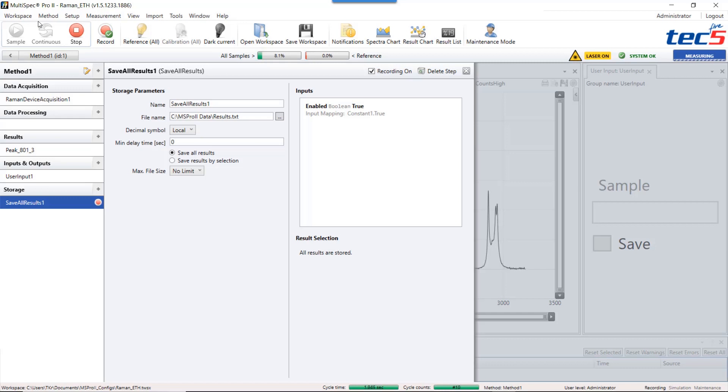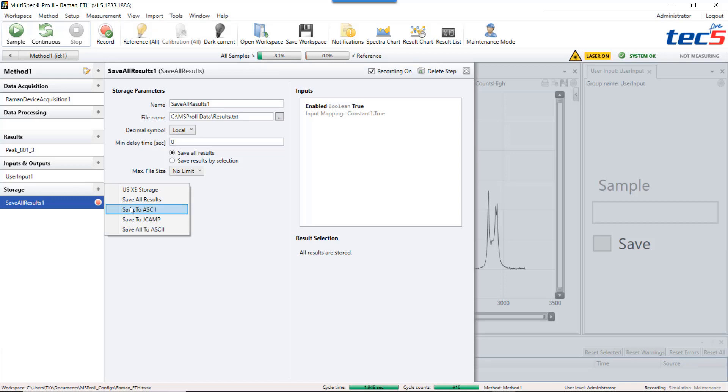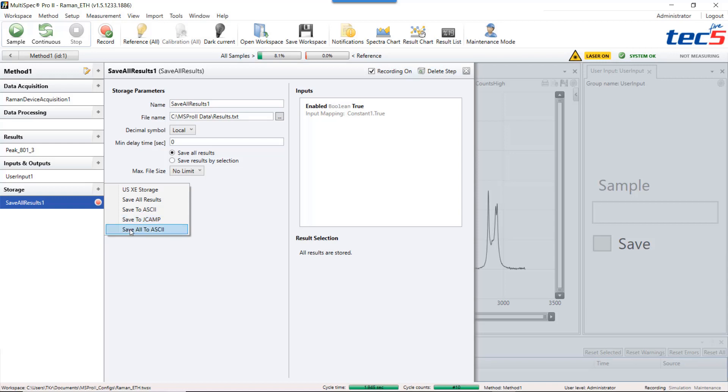With Multispec you have three options to store spectral data. The first one is a simple text file called ASCII. The second one is a spectroscopy data file called JCAMP. And the last version saves all spectra and the results in a single file. It's called save all to ASCII. As the parameterization is very similar I show you everything in save to ASCII.